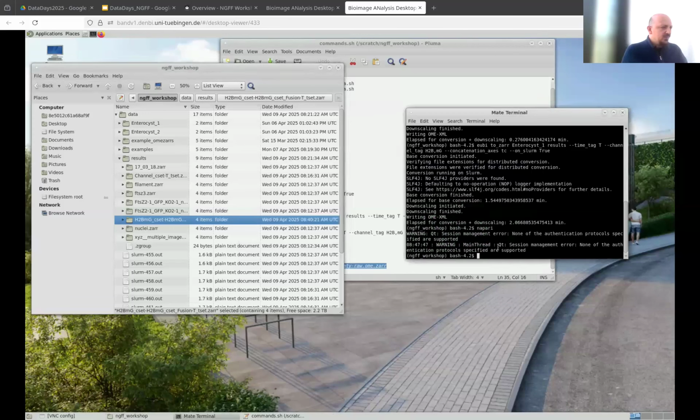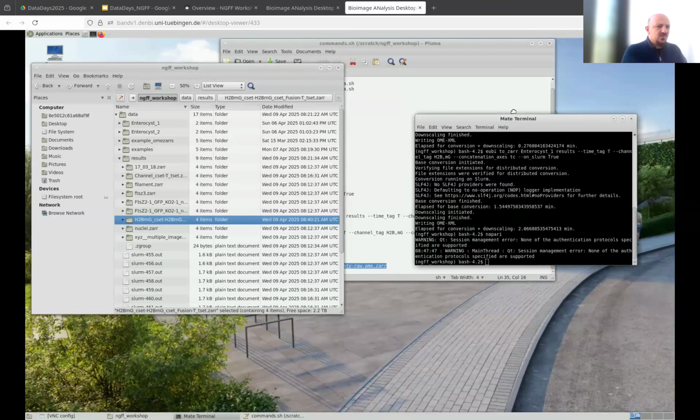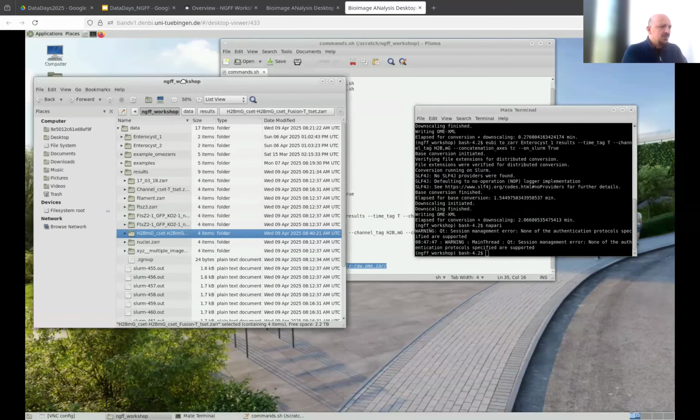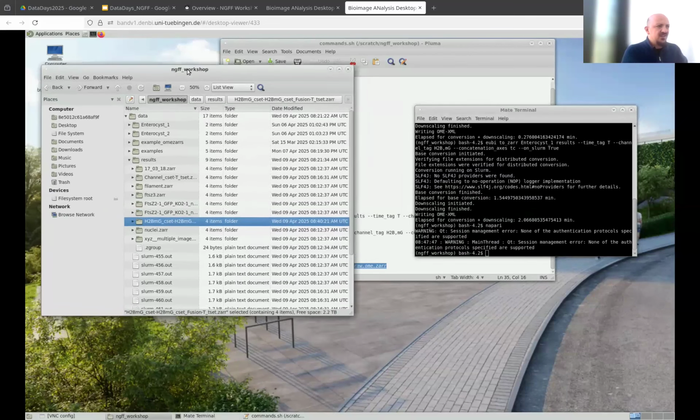So there, I would say that the most comprehensive tool to inspect the OME-Zarr metadata at the moment is this so-called NGFF validator. And there are different ways to access it. This is actually a browser-based tool. And you can simply construct a link on your browser. It would go to that OME-Zarr and it would validate it.